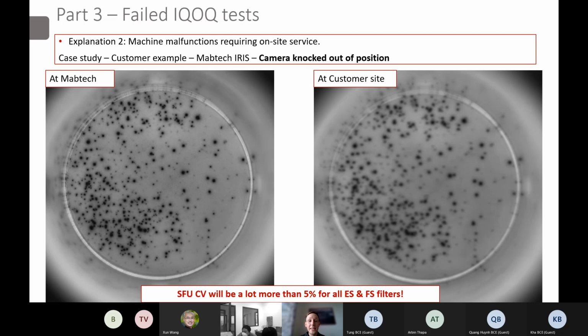What we did in this case is that we worked together with the distributor. We did some quick service work and we restored the function of the instrument completely. So it was possible to fix quite fast. This is a good way to capture when service work is required.